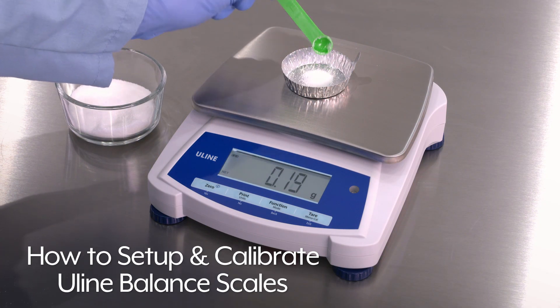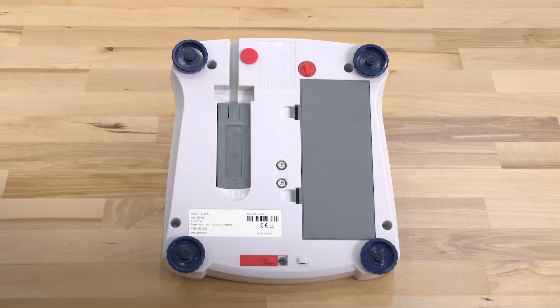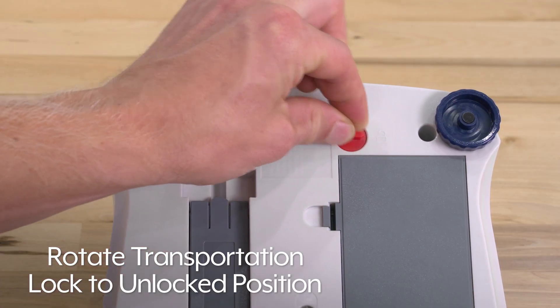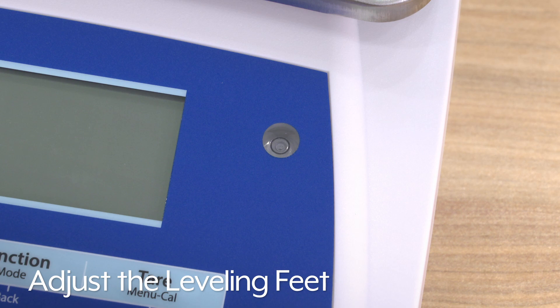This video will show you how to set up and calibrate Uline balance scales. For initial setup, turn the scale over and turn the transportation lock to the unlocked position. Adjust the leveling feet so the level bubble is centered in the circle.